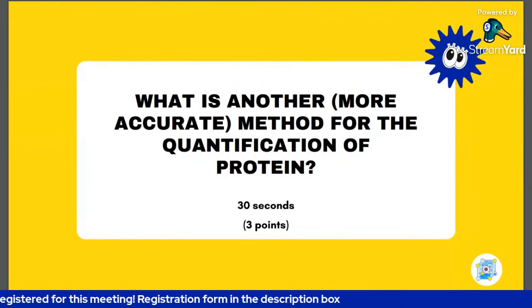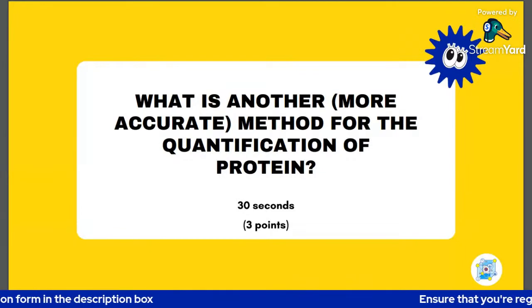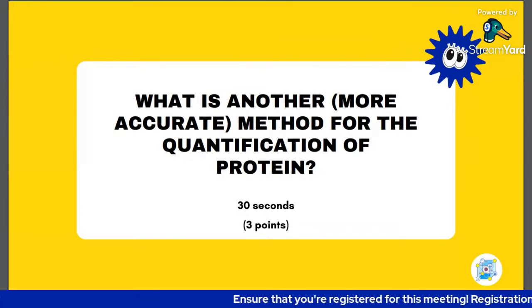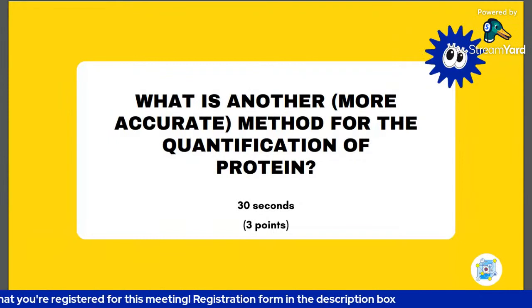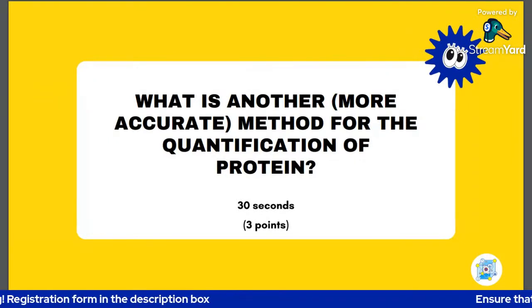Then for any other sample you have, you react it with the Bradford reagent, measure the absorbance, and extrapolate the concentration from your calibration curve. So the answer was the Bradford assay.